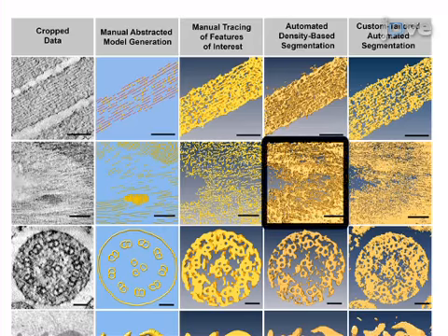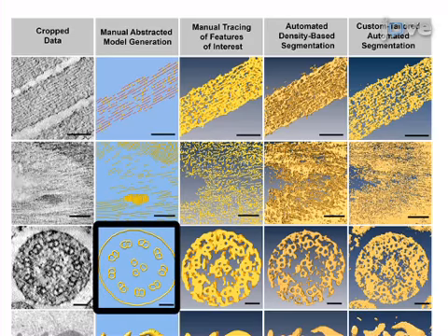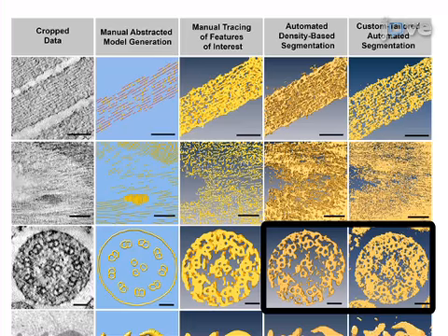For the resin-embedded stained tomography of a plant cell wall, automated density-based segmentation was most effective to quickly extract the cellulose through many slices. The manual methods took more effort on only a few slices of data. Manual abstracted model generation produced the microtubule triplet in the stained tomography of kinocilium, while the two automated approaches extracted the densities more quickly and were therefore preferred.